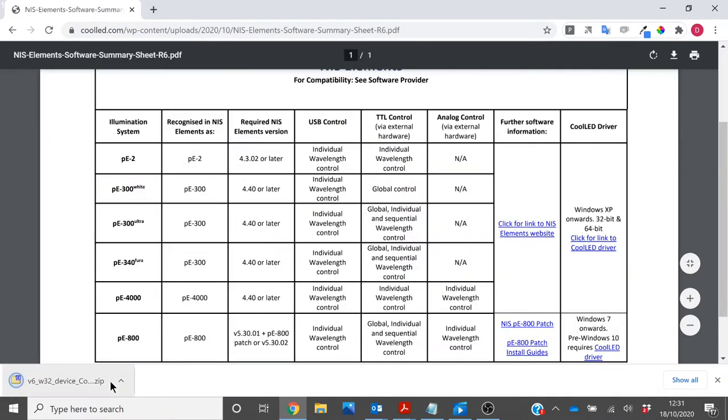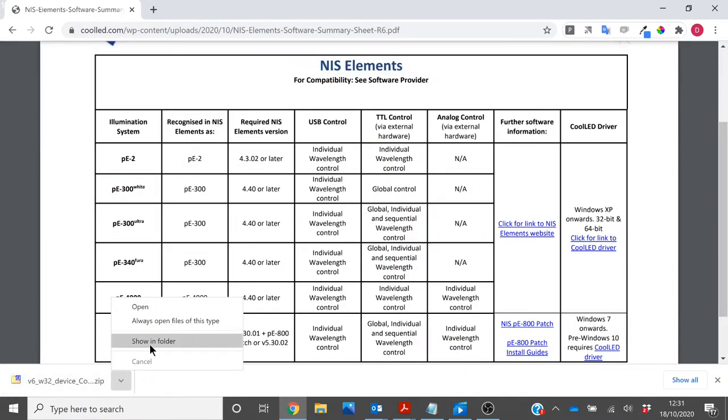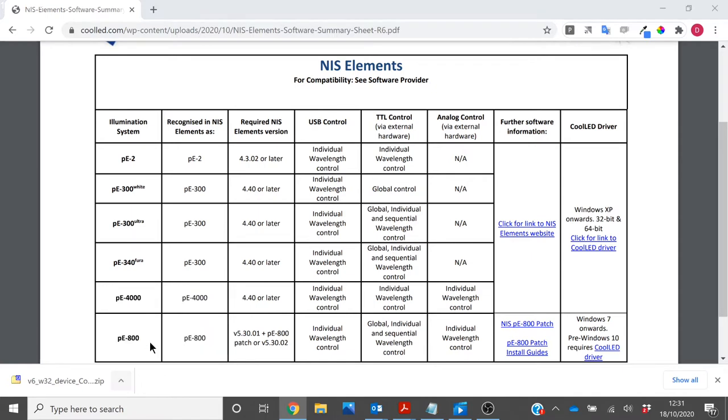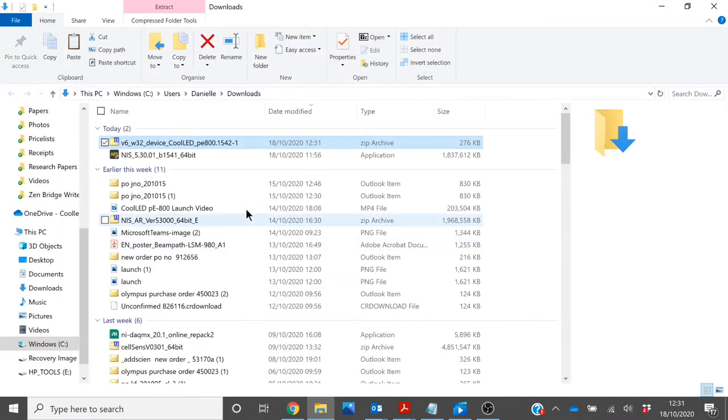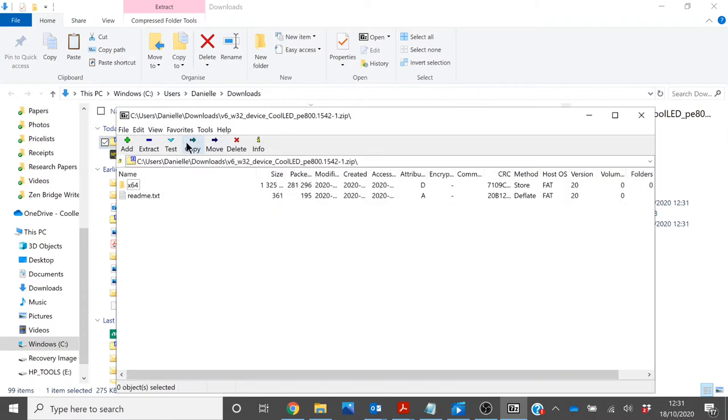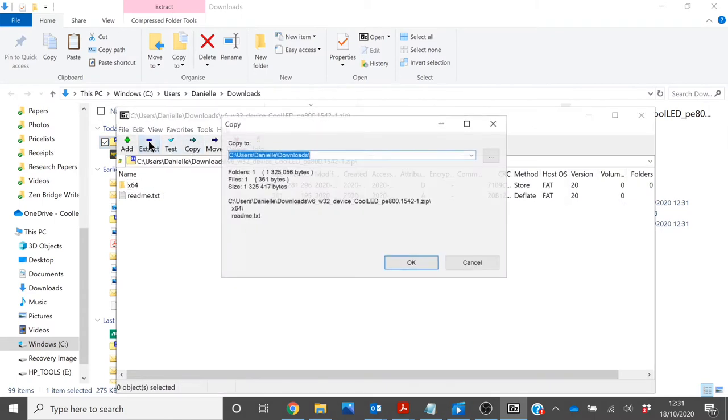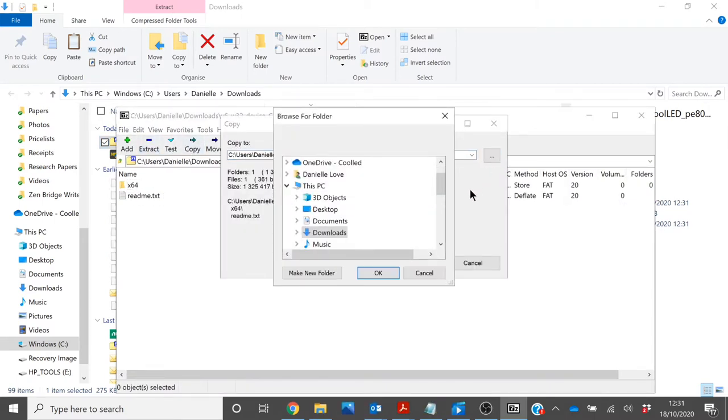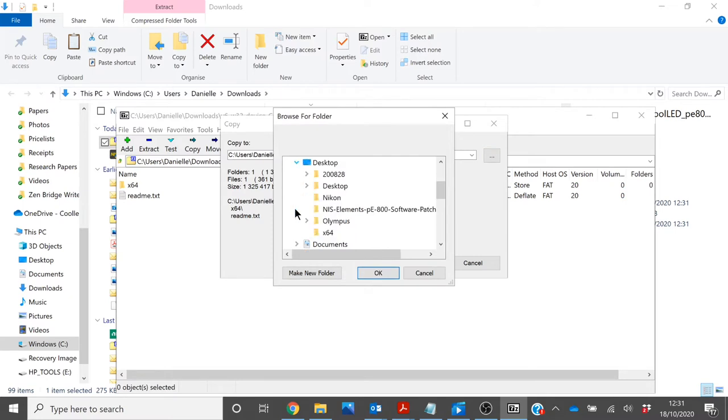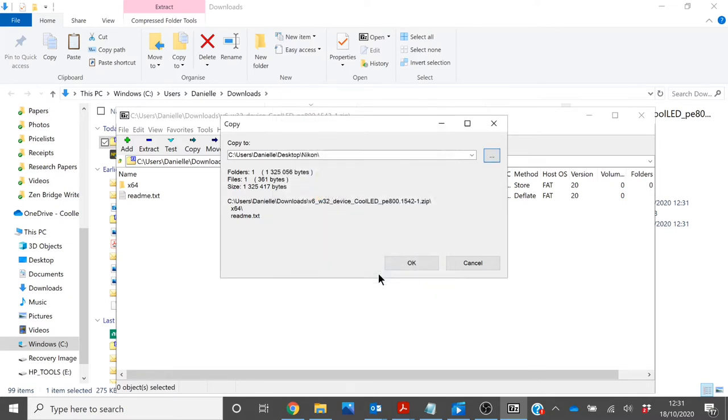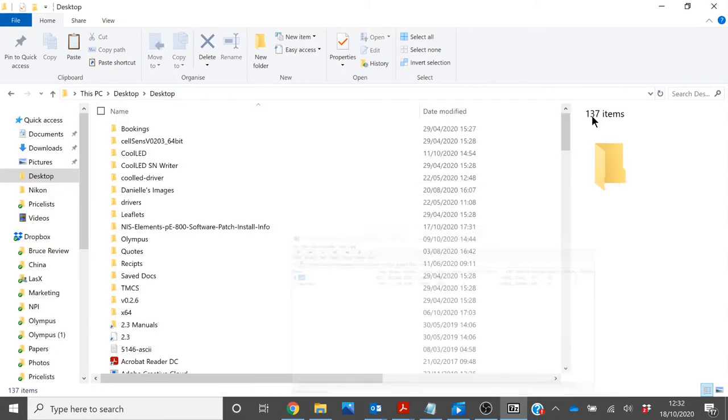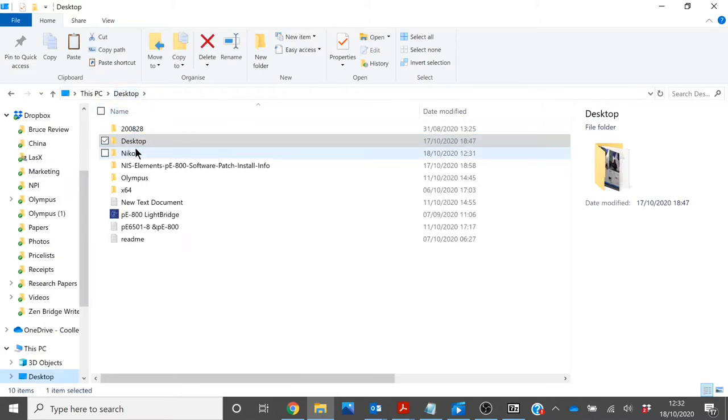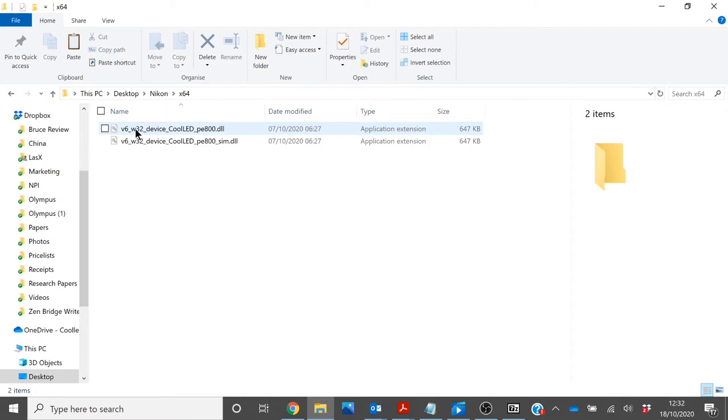Once the patch file has been downloaded, you will need to locate the file and extract this file to a memorable location, for example, your desktop. Once extracted, head to the destination the file has been saved to and open X64.